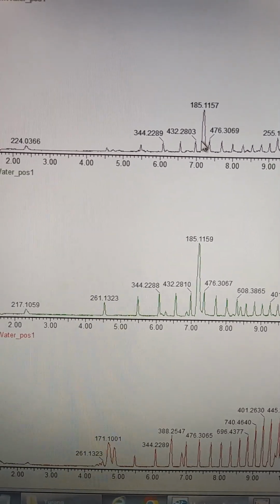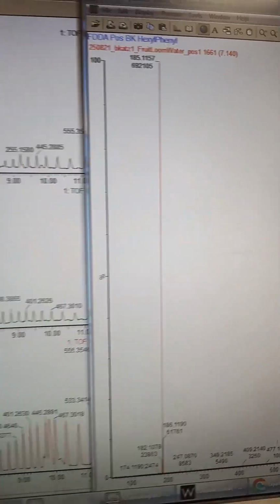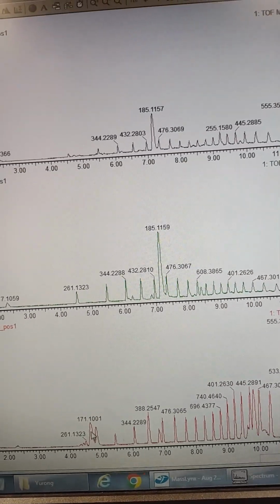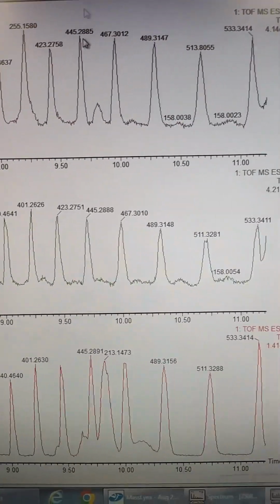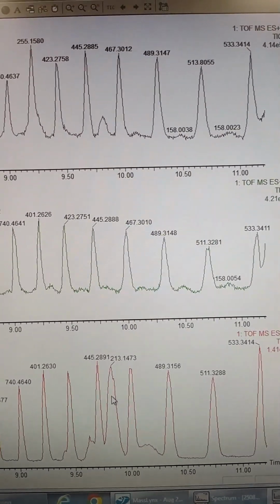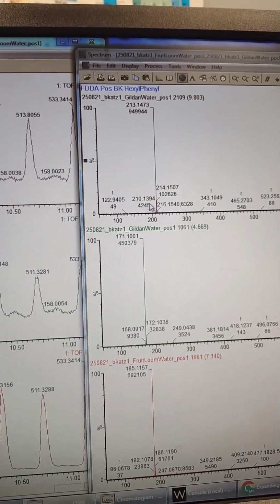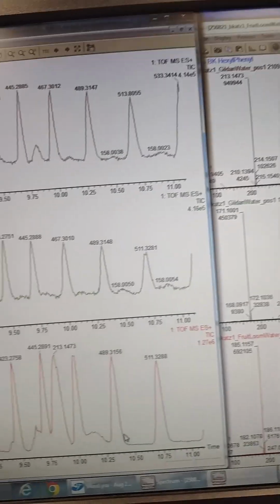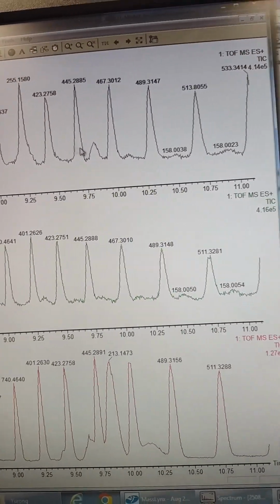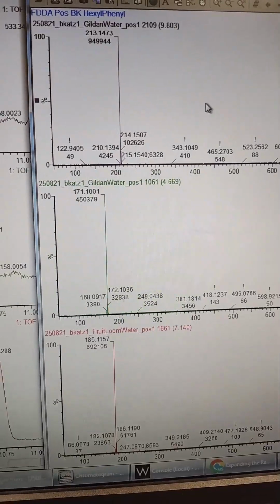All right, so the interesting things to identify. We have this mass at 185 that we're gonna try to figure out what it is. It looks like 185. And we have this one at 171. We're gonna try to figure out what it is. And then I was talking about there's a mass that's kind of hidden in here at 213 that we're gonna try to figure out what it is. And those are kind of the most curious of the things, in my opinion. So maybe we can figure these out. Let's give it a try.